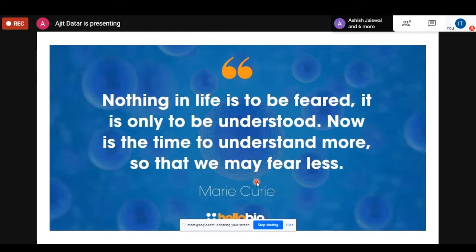So you should first discuss this kind of sample with somebody who understands mass spectrometry very well, and then give the samples with proper instructions to the operator who is operating the machine. Remember, most of the institutes have operators. They don't have scientists working on that machine. Operators will only operate the machine as per the instructions or SOP which is given, and that SOP may not be valid for your sample. So problems come because of that.